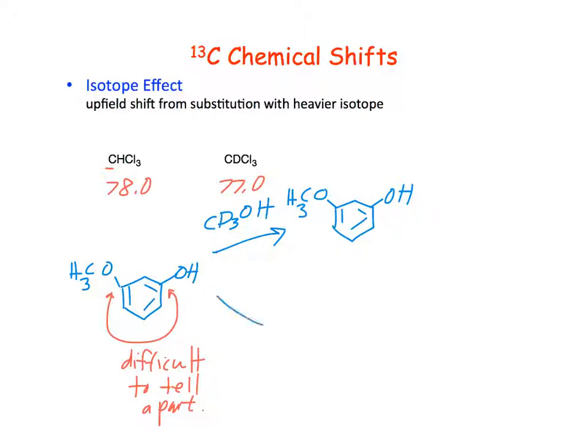Or we could run this in D4 methanol, and in this case, the H would exchange for deuterium, and we would have OD.